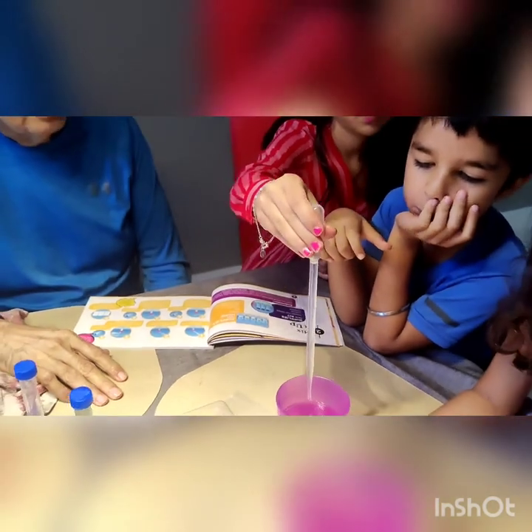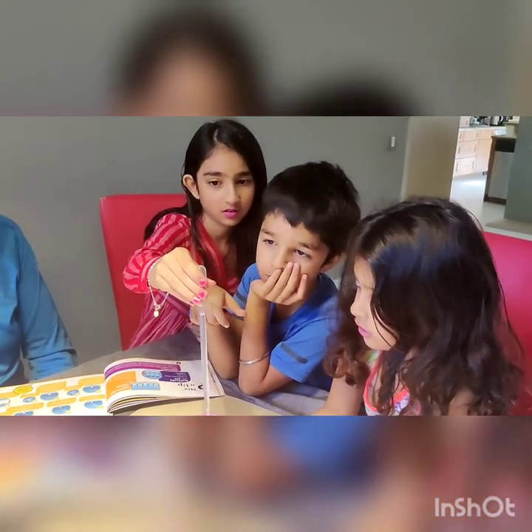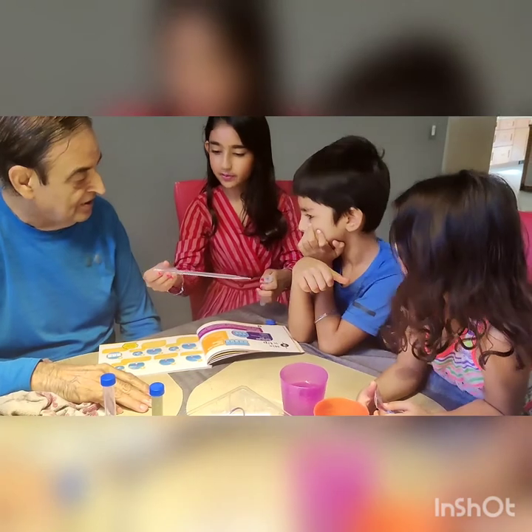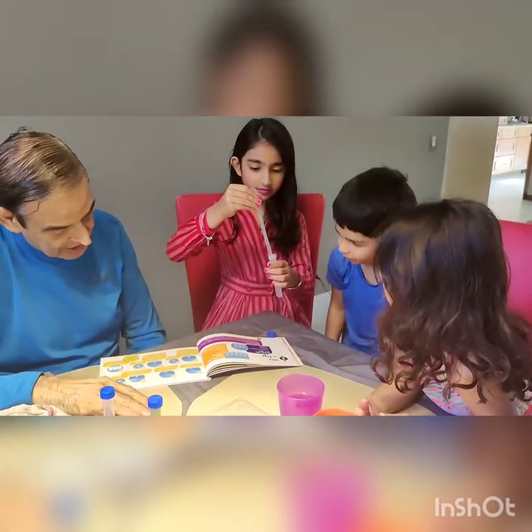Perfect. What did you do? She's putting water in the pipette. It's called a pipette. Yeah, exactly. You know, a pipette is to measure. How much have you put? 5 ml. Okay. 5 ml water into the test tube.